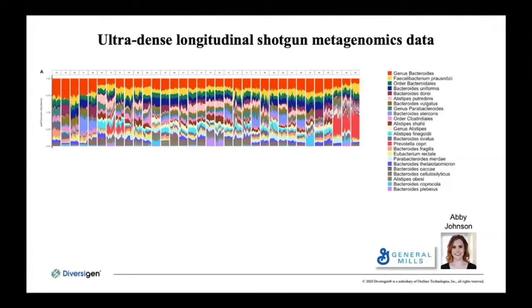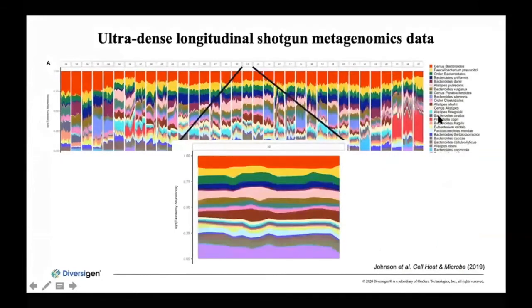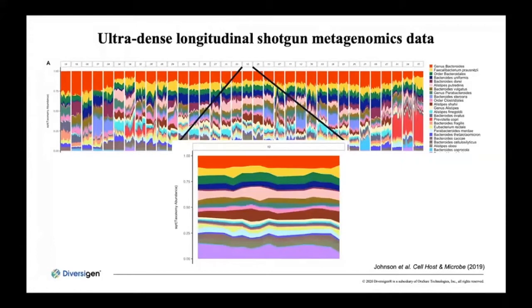Some people are more outliers than others. You can see those 3 Prevotella carriers over on the right. That red color is Prevotella. But overall, everyone has something unique about them in their microbiome. You can also see that some people are more variable than others. And for example, zooming in on one here, this is Abby's microbiome. She gave me permission to show this. She had the most stable microbiome of anybody in the study, which she was very proud of, being a registered dietitian. And this is a whole new feature of the microbiome that we can begin to use in clinical studies, which is the stability.